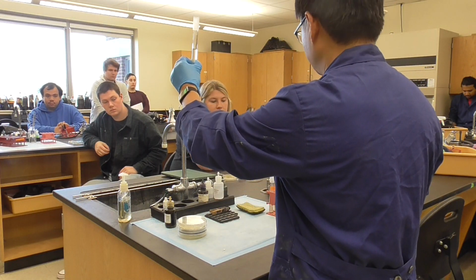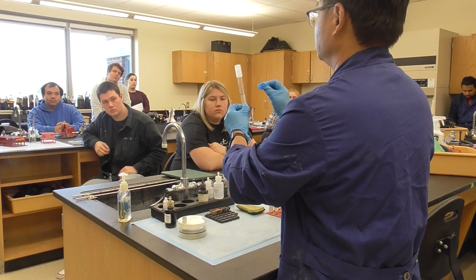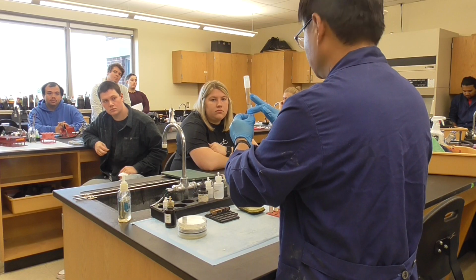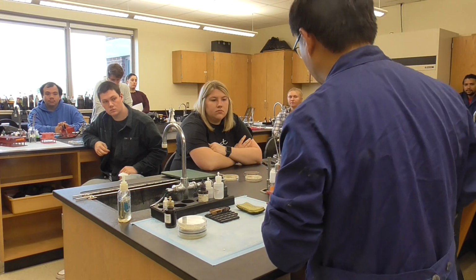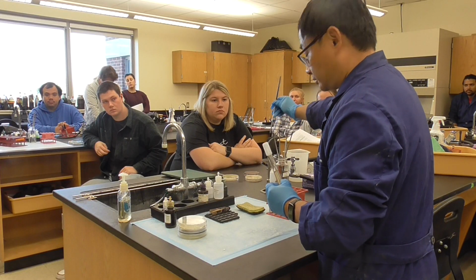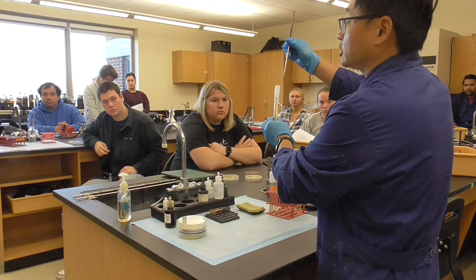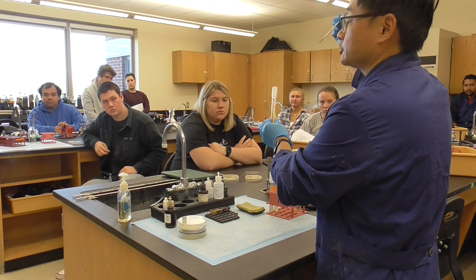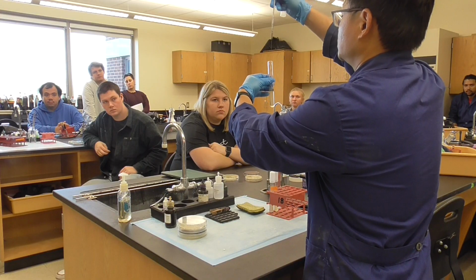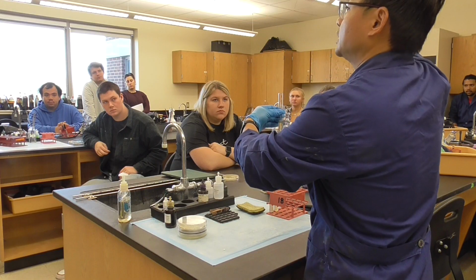SIM tube, okay? First thing you're going to label. You put your bench number, you name the bacteria you inoculated. I'll just show you a demonstration. I'm not going to turn on the fire. If you turn on the fire, you have to flame it. Then, coming from this, your agar culture, let's say, pick the culture. Then you go inside. Make sure this is straight, okay? Straight forward down. Gently take it out. That's all.